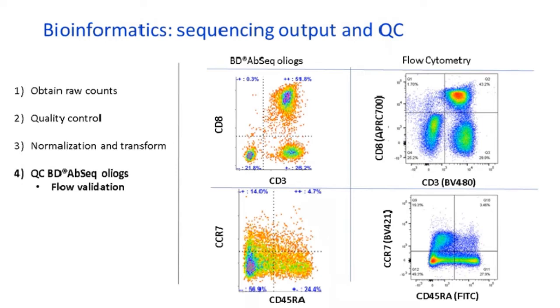Then you can see the CD3 positive, CD8 negative on the lower quadrant, and there's a CD4, and then you can see some double negative as well. So these CD3 negative cells, those could be, for instance, monocytes. And interestingly, we have done a parallel experiment where, from the same sample, we took an aliquot of cells and we looked at classical flow cytometry.